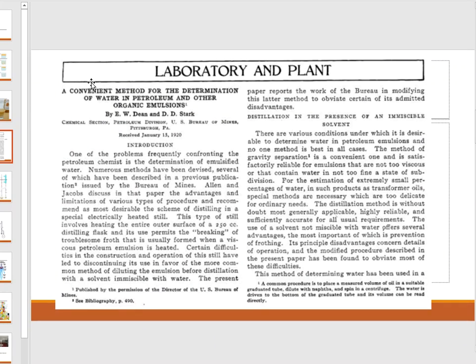day. So it says, a convenient method for the determination of water in petroleum and other organic emulsions. E.W. Dean and D.D. Stark, Chemical Section, Petroleum Division, U.S. Bureau of Mines. Received January the 15th, 1920.